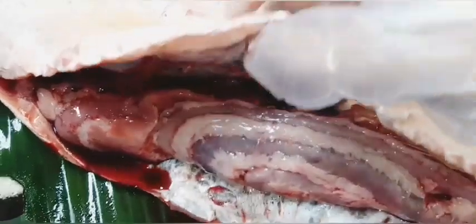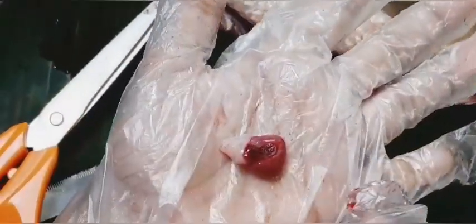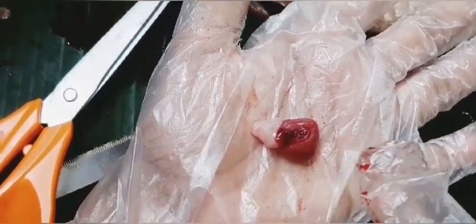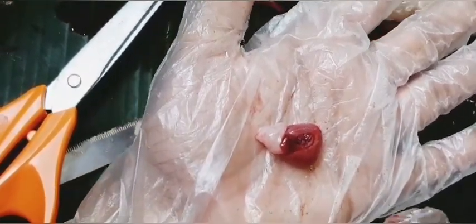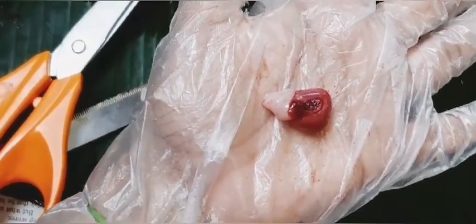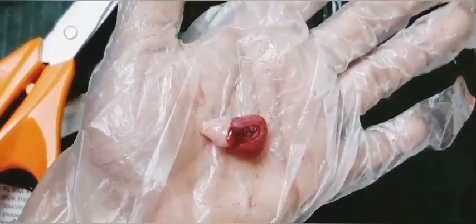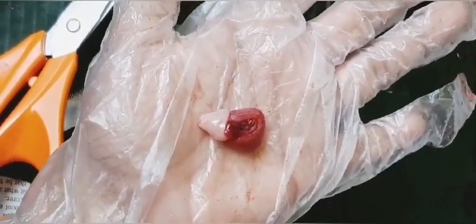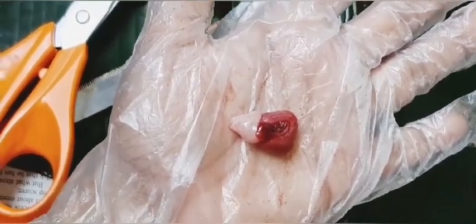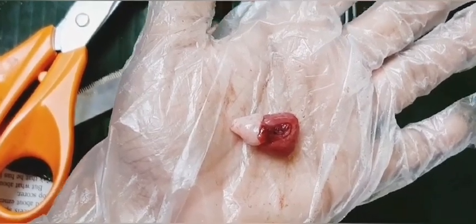So now at first I want to show you the heart. So it is the heart of the fishes, and this heart is generally of 2 chambers. There is one auricle and one ventricle, and with the help of this heart and the gills, the fish can respire. So generally in fish there is a single circulation, that is, the blood goes only one time from the heart in one cycle.